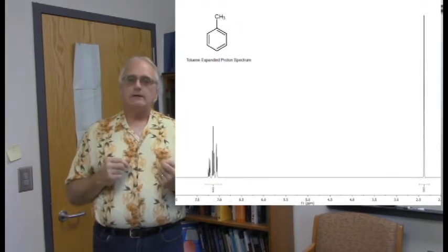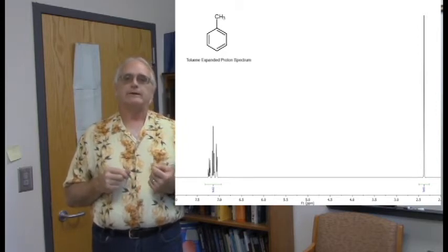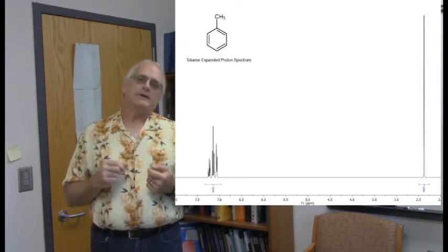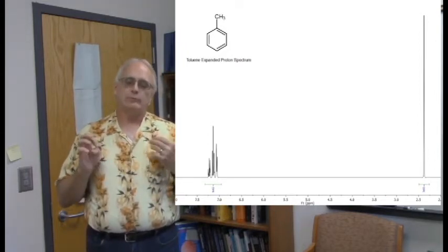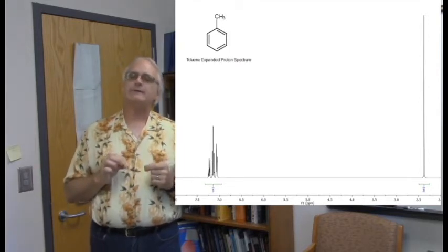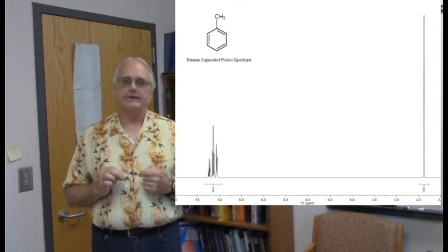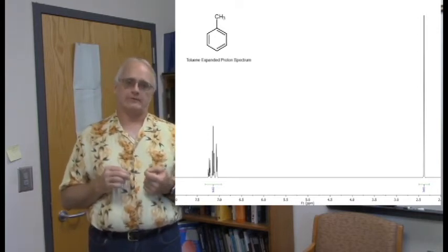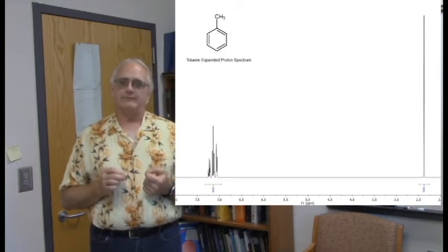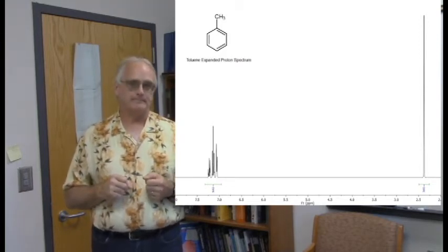When zoomed in, we start to see that there really are three aromatic signals — the ortho, the meta, and the para. Sometimes you can see that, but even when they're really close together, it's difficult to get the integrations to be perfectly 2 to 2 to 1. So sometimes even on a zoomed spectrum, you will see it integrated simply as a group of five — five aromatic protons, singly substituted ring.